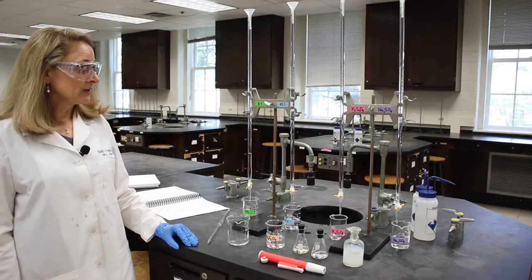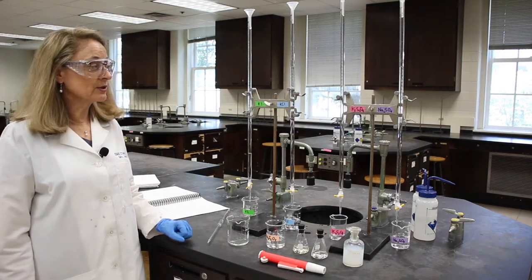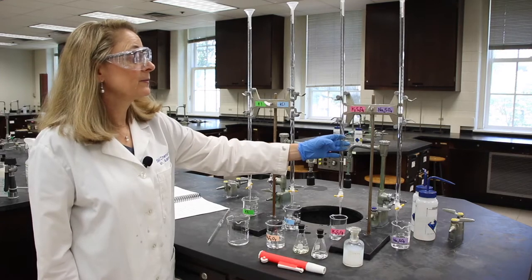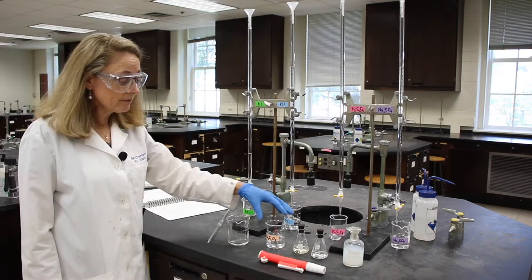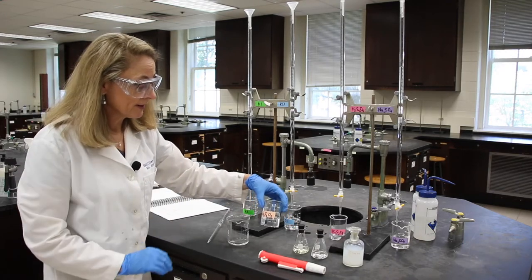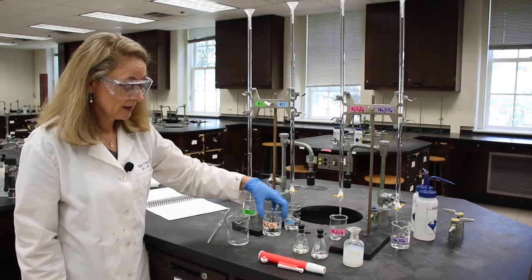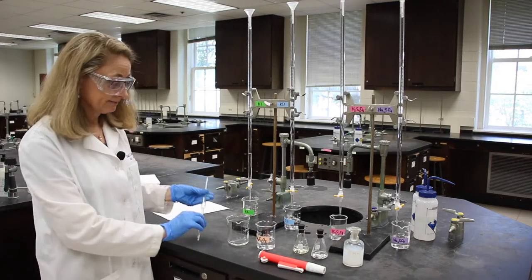The first thing we needed to do is to fill our burettes with the four solutions: potassium iodide, potassium chloride, potassium persulfate, and sodium sulfate. I've normalized those burettes already and filled them, and I have also obtained sodium thiosulfate in a beaker, and I've normalized my pipette with that.